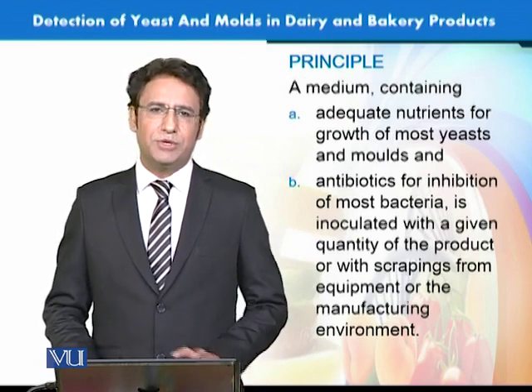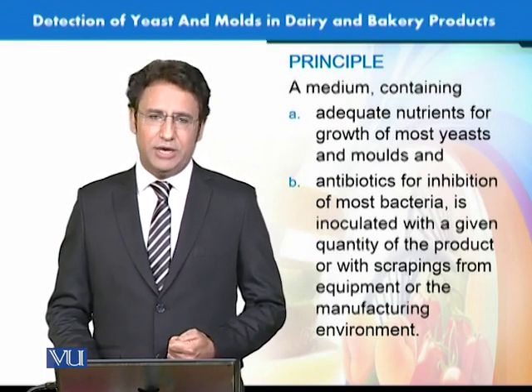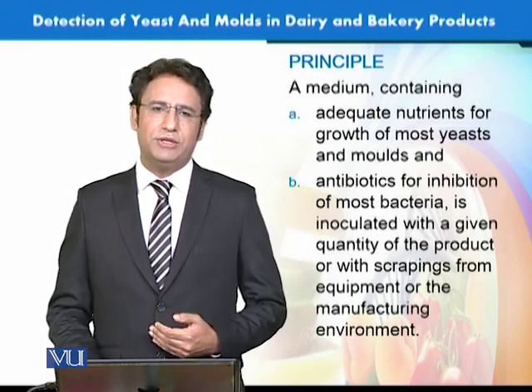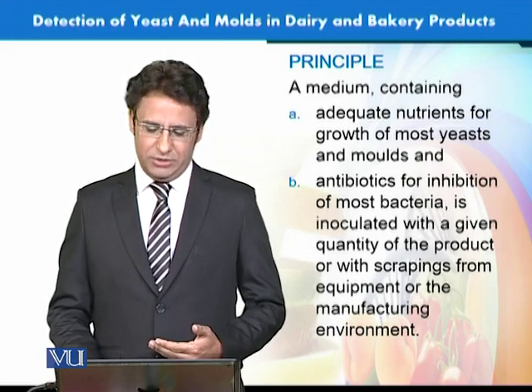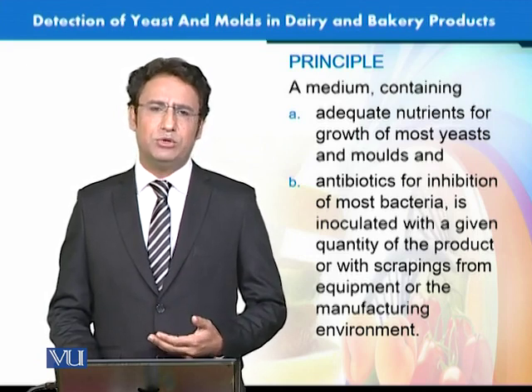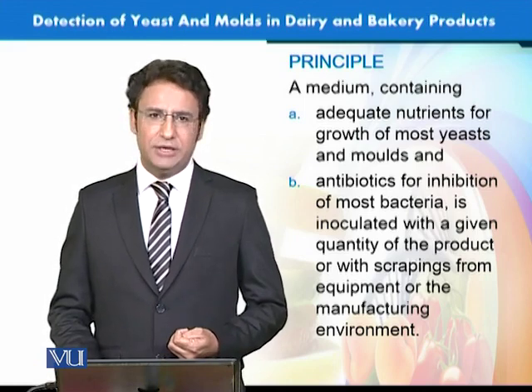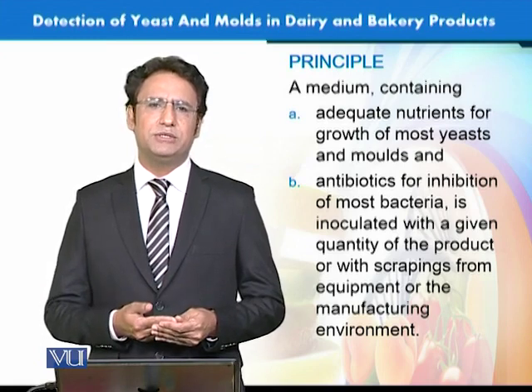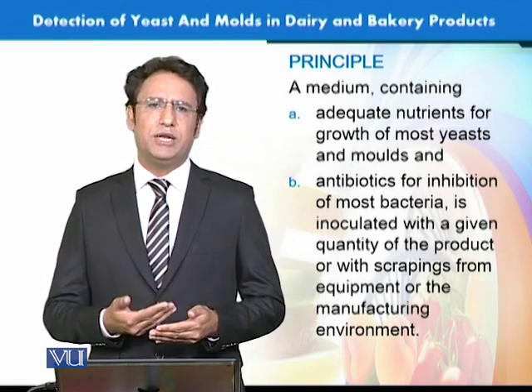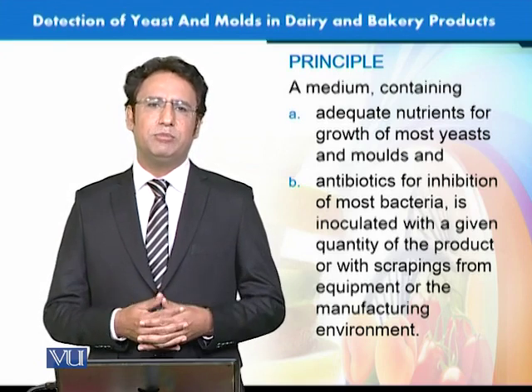If we talk about the principle of this microbial analysis, we need to have the nutrients needed by these microorganisms, especially yeast and mold, to grow in a specific media. The second thing is we have to add antibiotics to these media, because antibiotics kill most of the bacteria so they do not show up in the final plates.